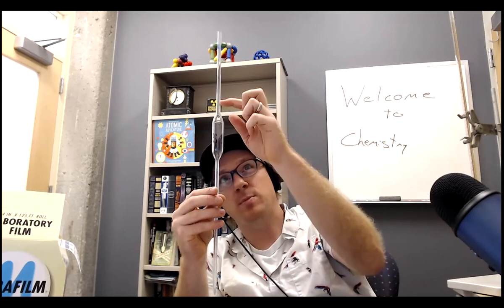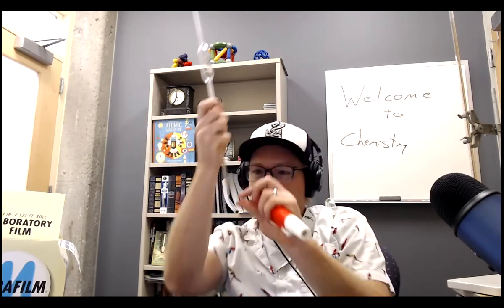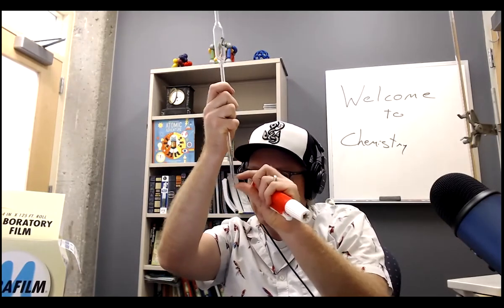So when you pulled up to here, you've actually pulled in a little bit more than 25. A couple of extra drops stay adhered to the surface, and that includes the last drop here. So you don't need to blow out any. That will be more than 25. You don't need to shake it so hard to get that last little drop out of the tip. If there's a hanging drop, kind of shake that one out, but the drop in the tip, leave that one. That's how you use a pipette. That's how you get exactly 25 mils into your beaker for trial 1.